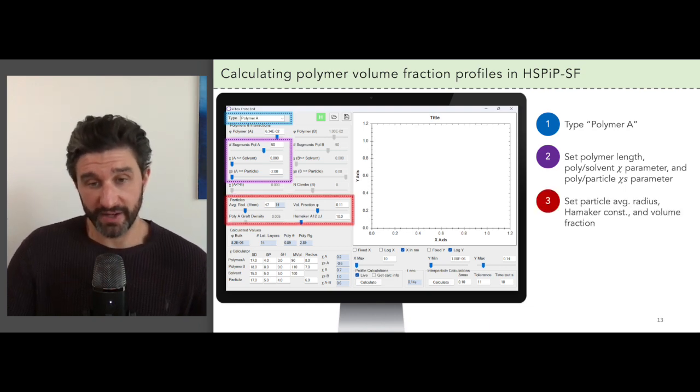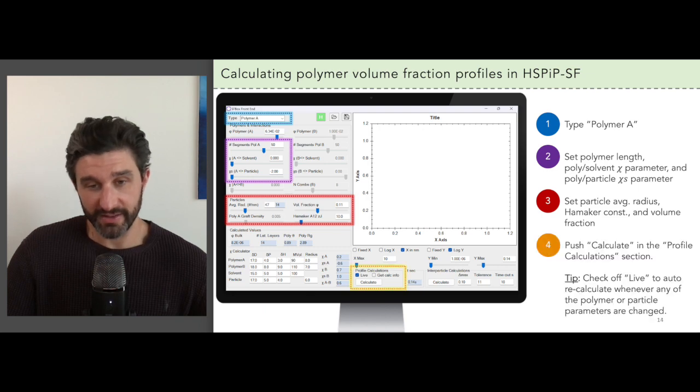Next we define the properties for the particles like the average radius, the Hammacher constant, and the volume fraction. And lastly, push the calculate button in the profile calculation section.